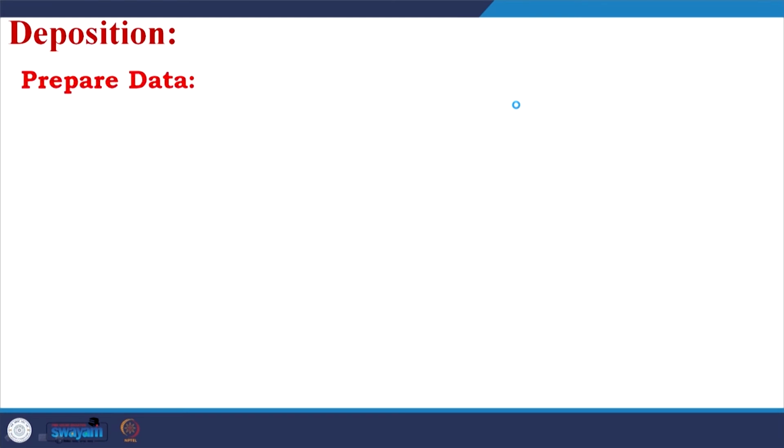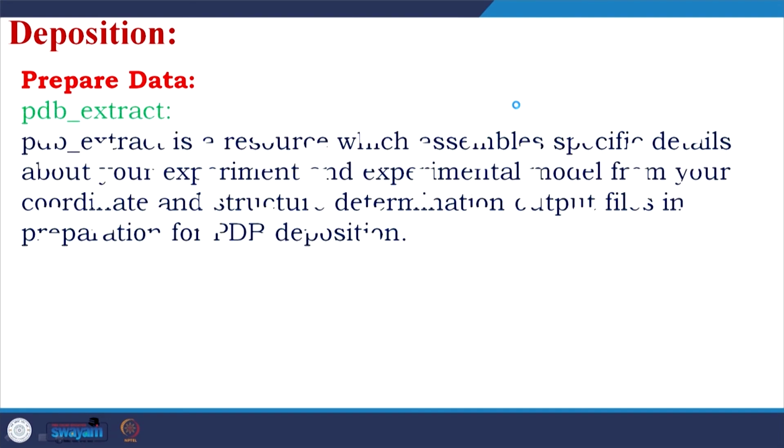For deposition, you have to prepare data. PDB_extract is a resource which assembles specific details about your experiment and experimental model from your coordinate and structure determination output files in preparation for PDB deposition.